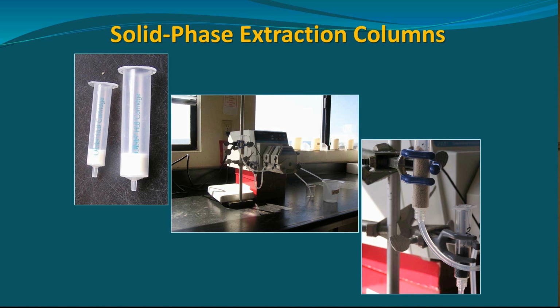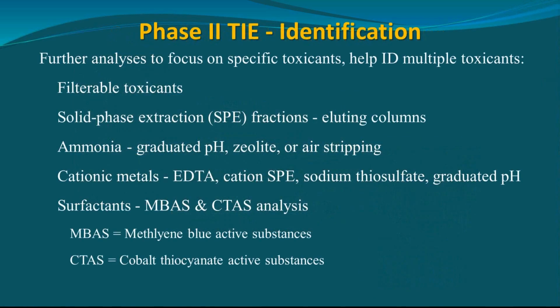One thing about TIEs is, I think dischargers are shocked at how much it costs to do them, because it's a lot of laboratory time and it's a lot of chemistry time. And so it's not a trivial process, for somebody that's out of compliance and has to go to this process. It's not trivial. Okay, so phase 1 was characterization.